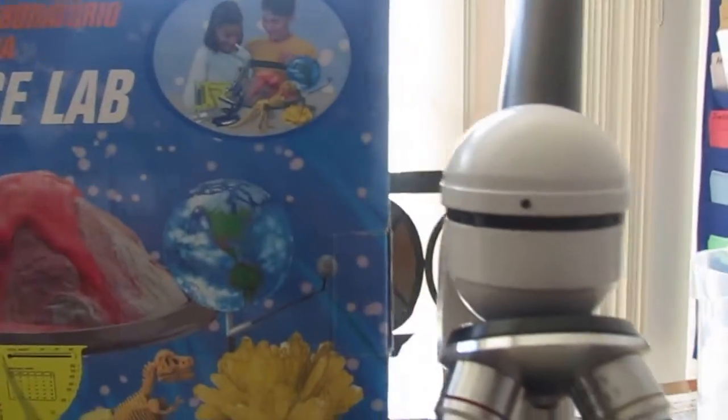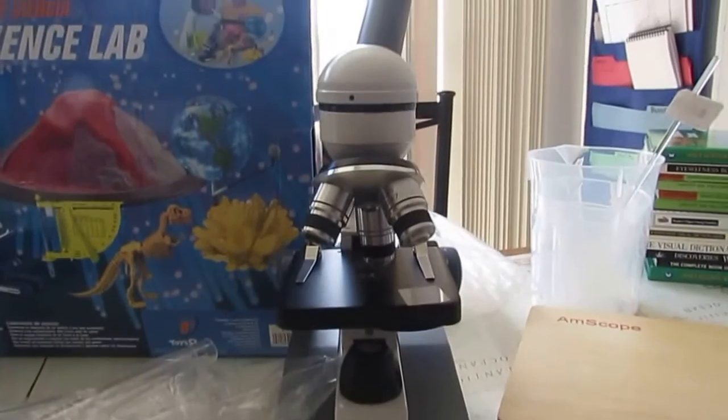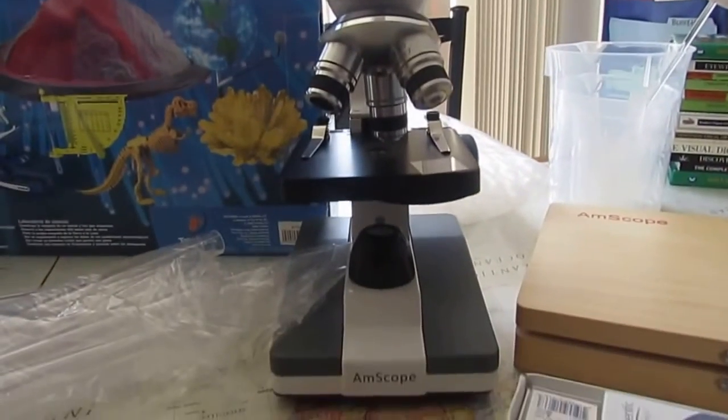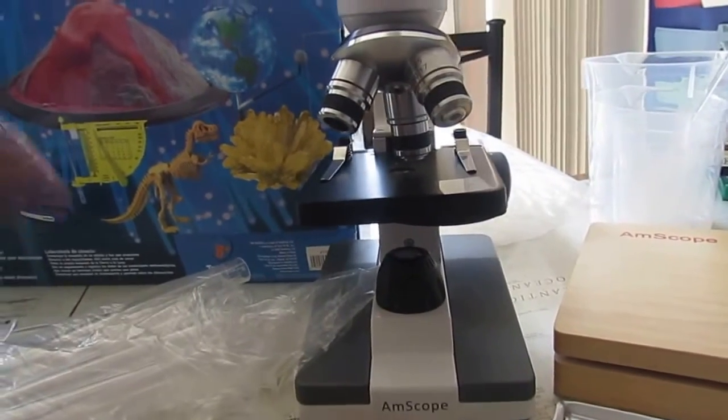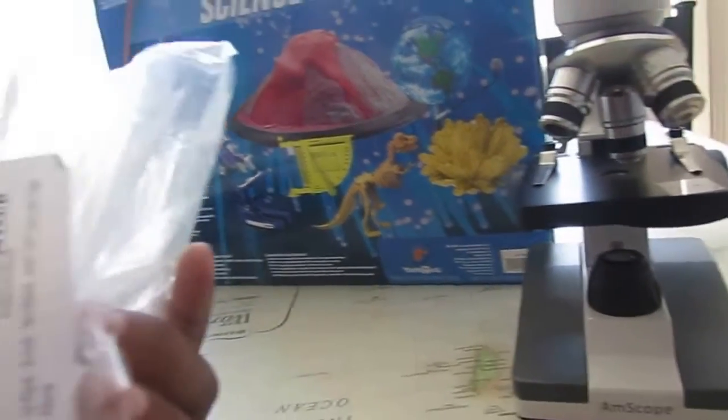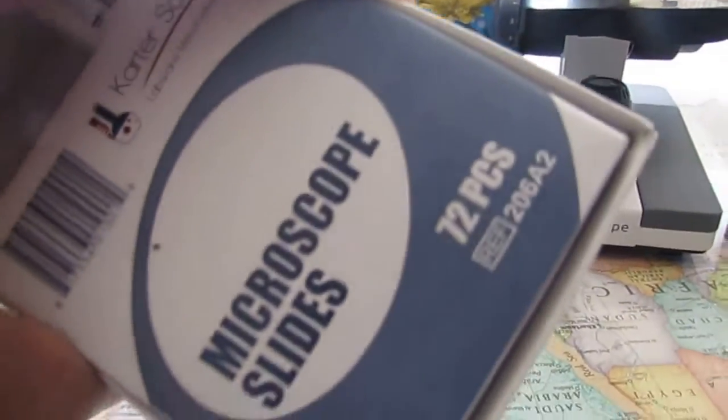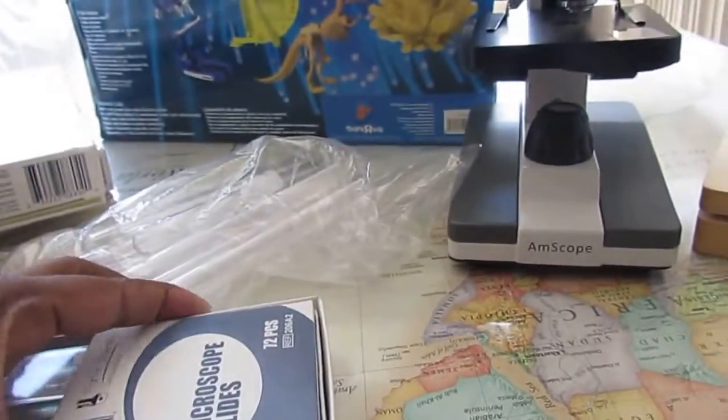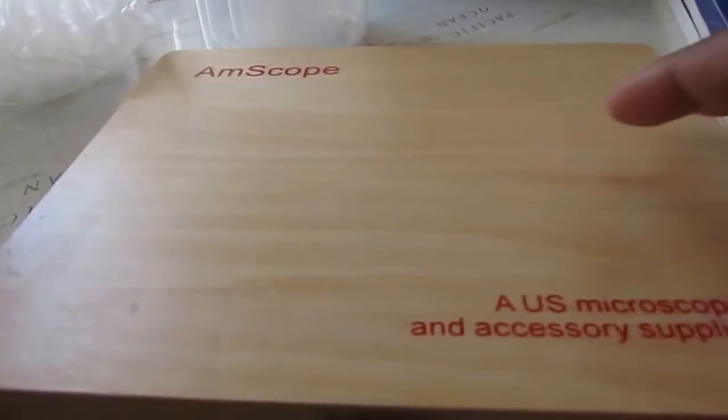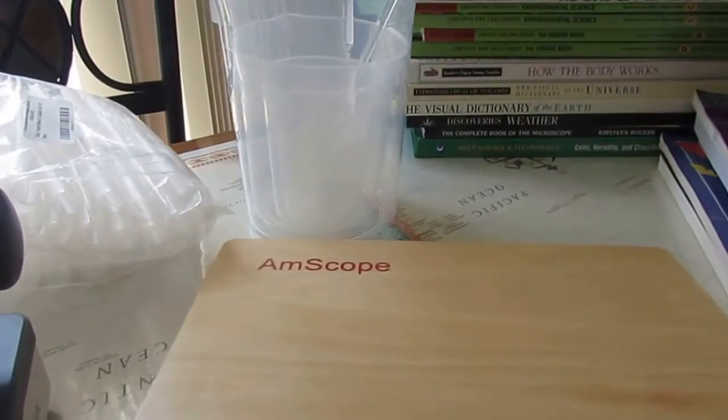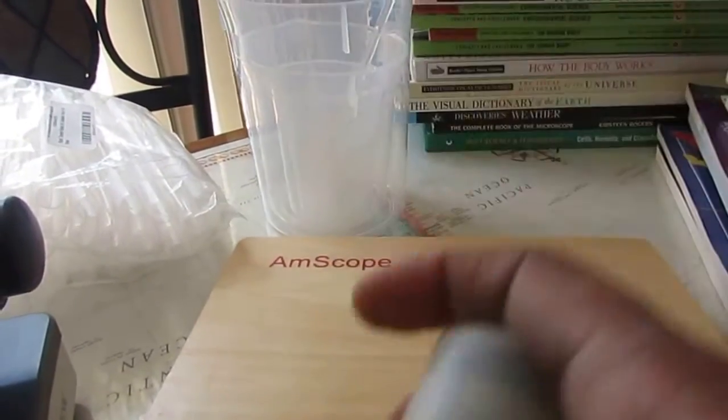Now going to my microscope. I got this microscope from Amazon. And I really like it. It also hooks up to our computer. Then I have a bag full of tubes with caps. We have microscope slides. And then we have the set of slides that's already prepared with the list on the inside.